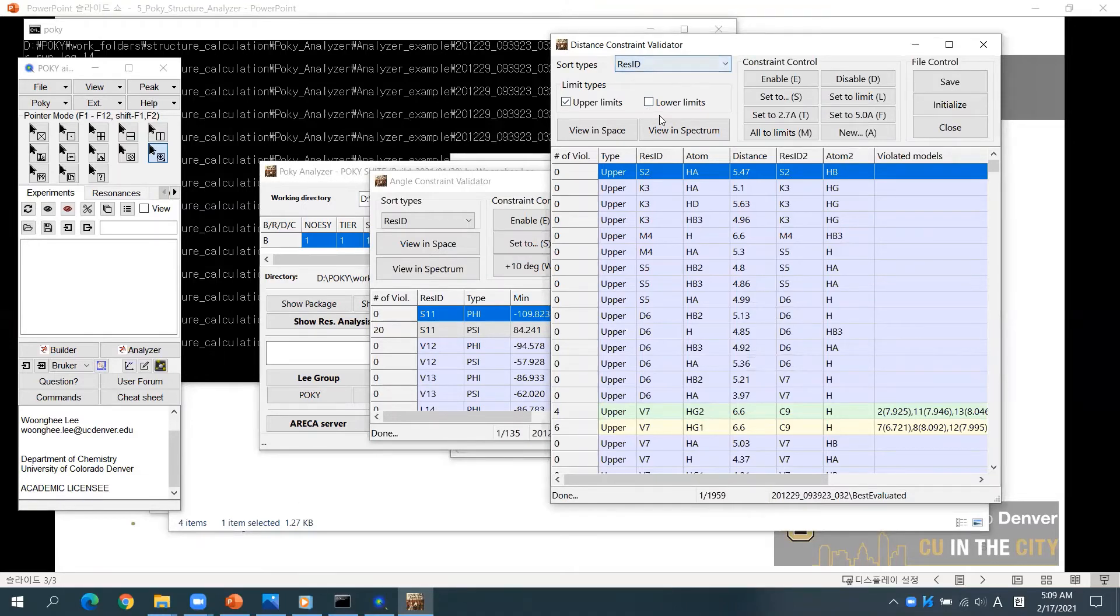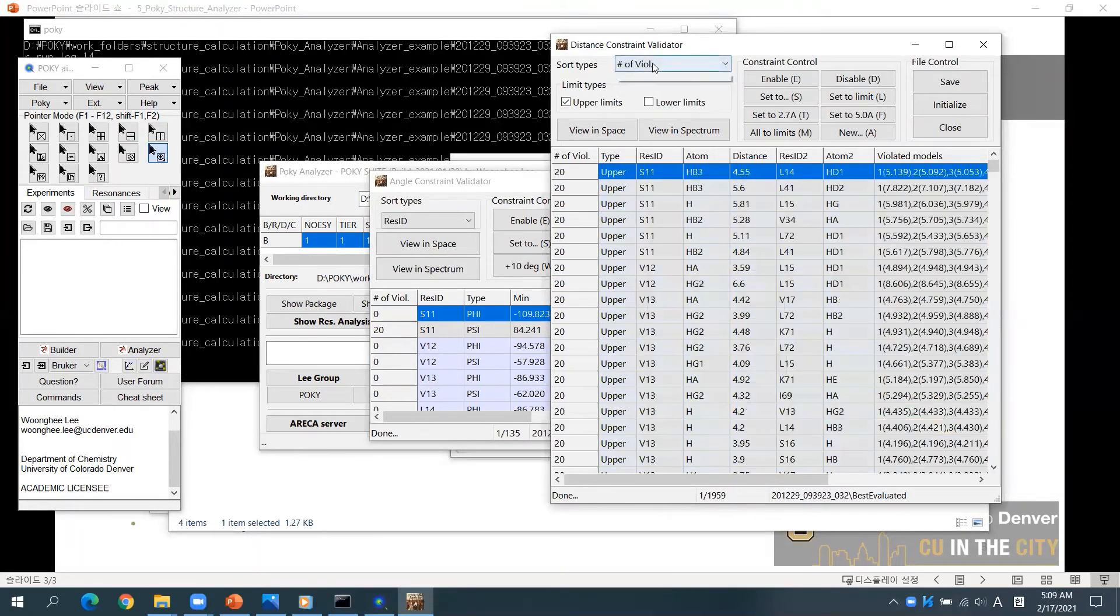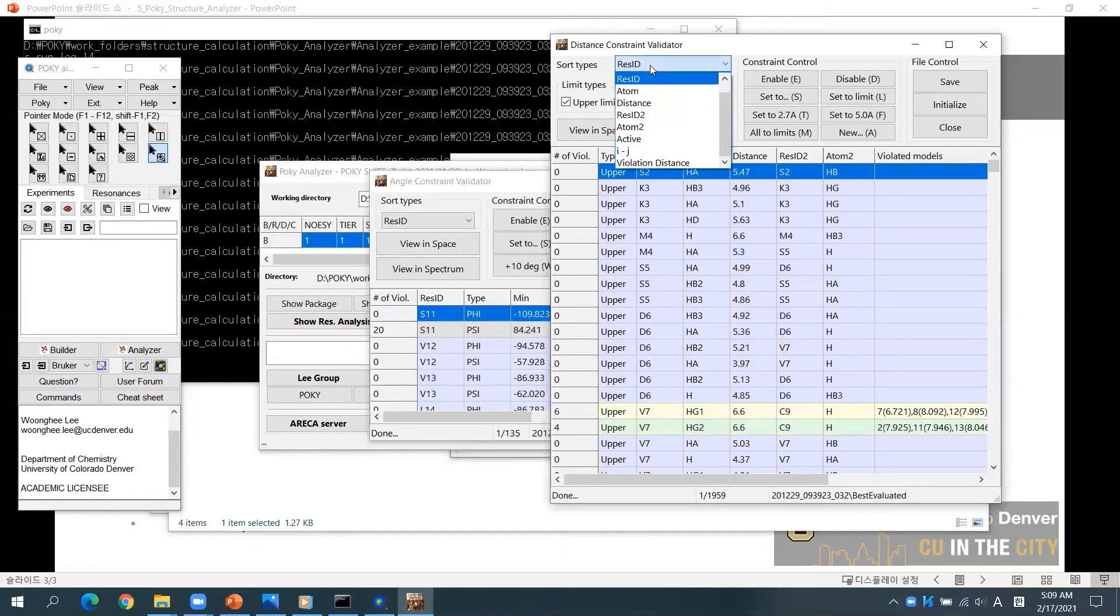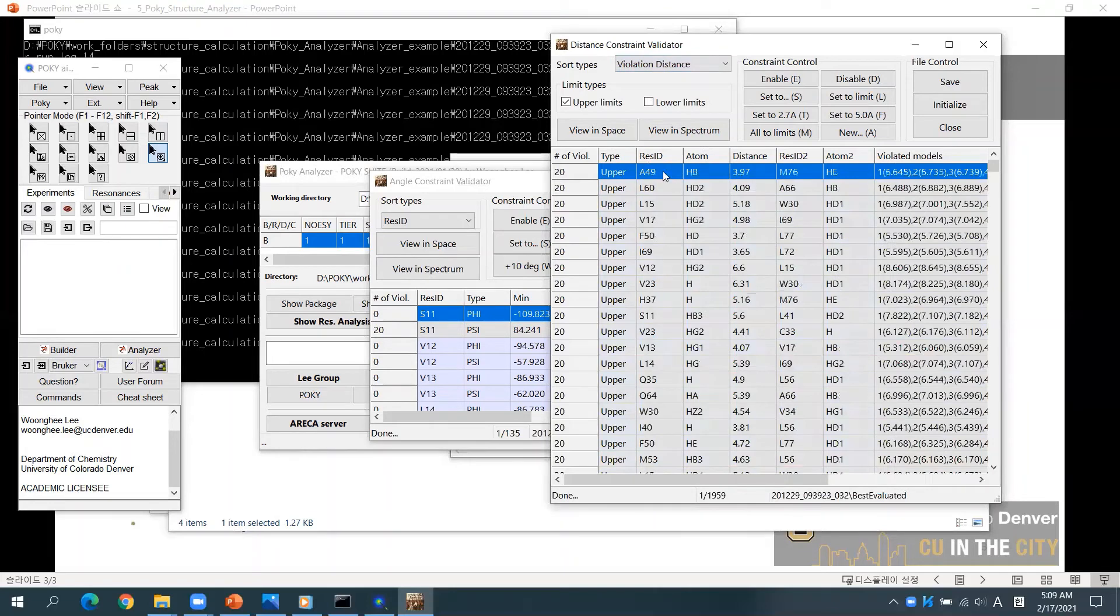You may sort constraints by the number of violations, residue ID, the distance between residues, and the violation distance. You can also see lower limits as you want.